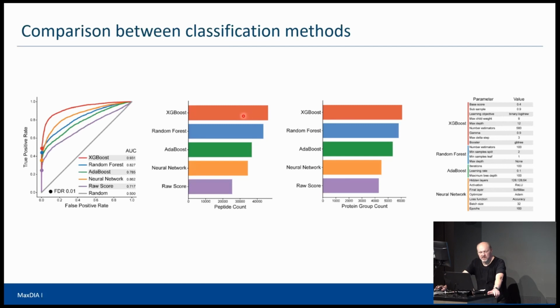The thing is, it's not just a fixed model that we put once in front of MaxQuant, but it's always training on the data that you provide. That means if your data is special in any way, let's say it has certain fixed modifications or fixed labels or whatever, it would actually always learn from the data that you are using. So it's always suitable for the data.